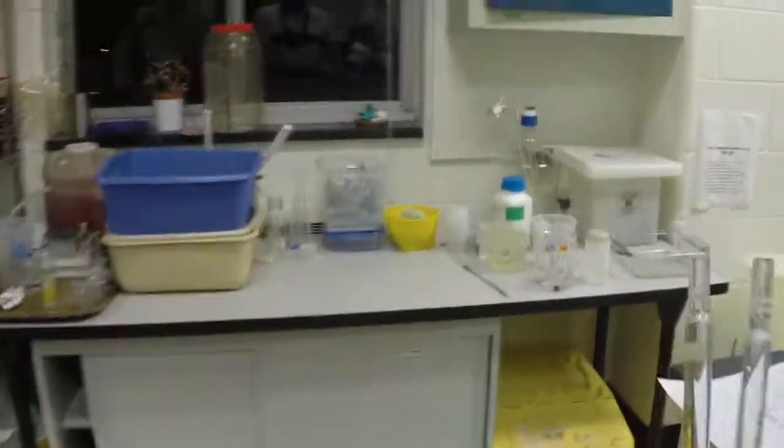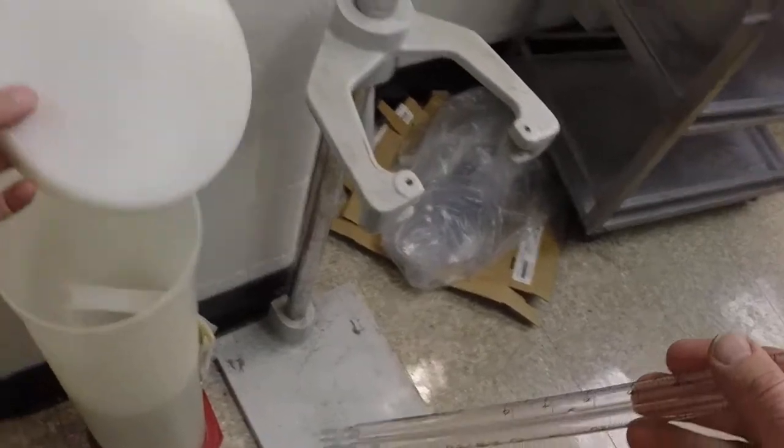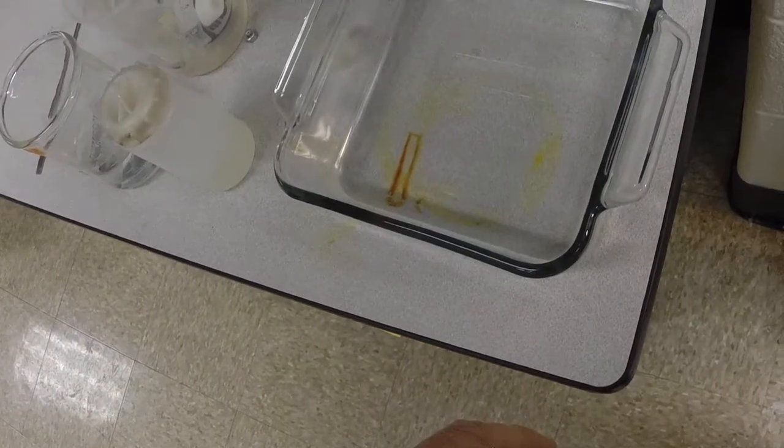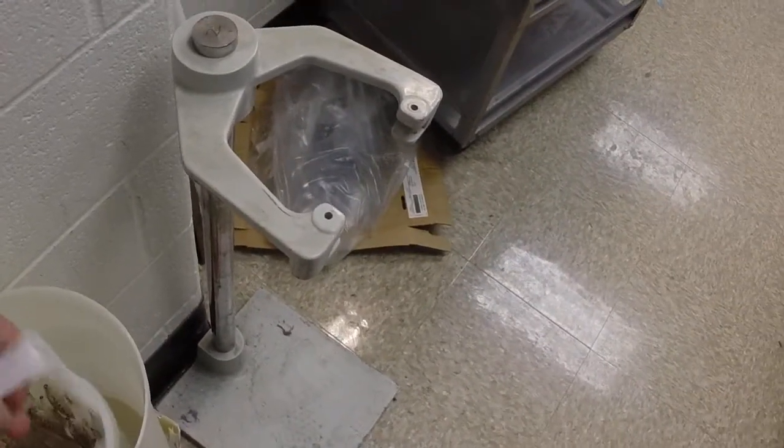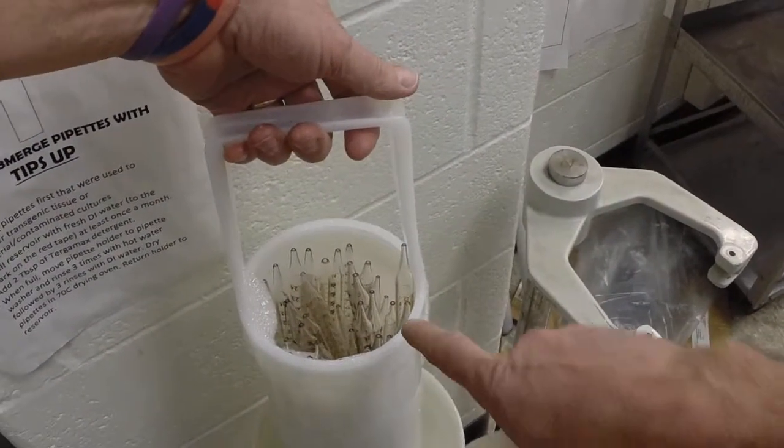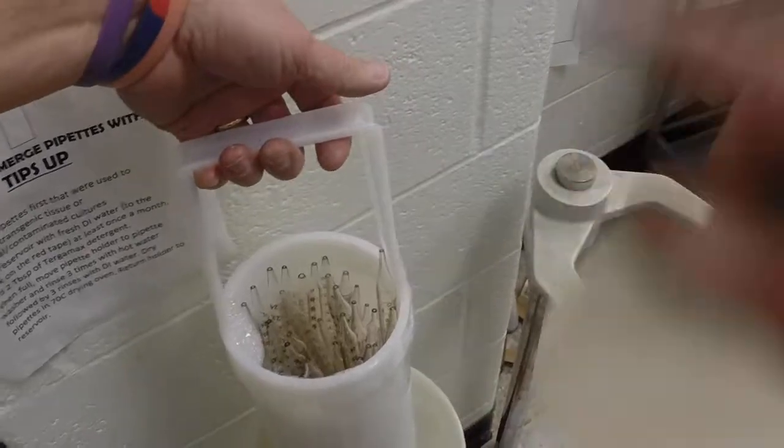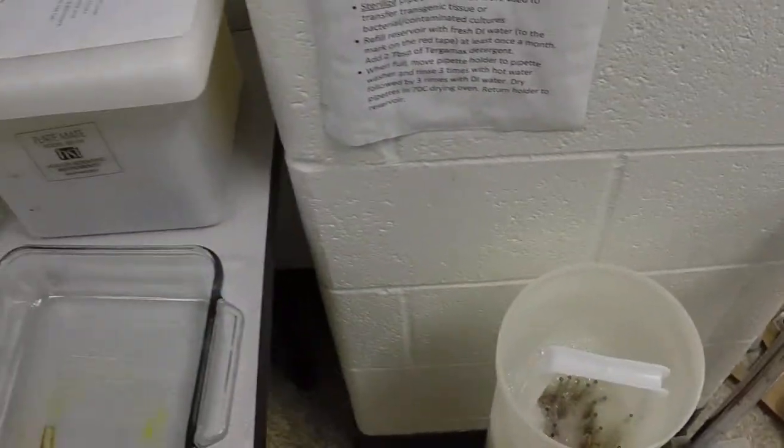So the process of washing the pipettes is they need to be placed inside the pipette washer upside down. If you look in here they should be going like that, and looking down inside all the tips are up. That's because the tips are small and if they're upside down they'll actually seal themselves and the water will not run up and down inside.